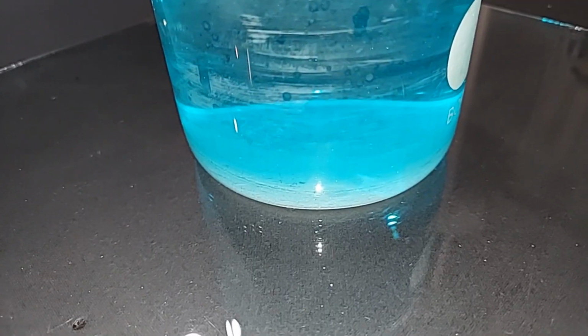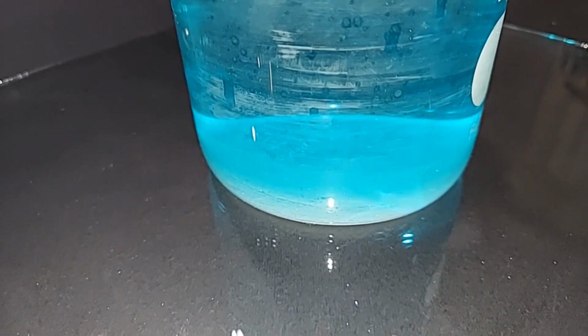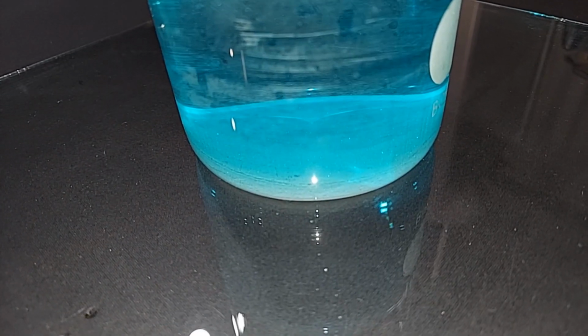Most of the copper 1 chloride has fallen to the bottom. There's still some in there crystallized. You can see the crystals. So I'll wait till it's completely done. But because this is insoluble in water, I'll dump out the top layer and then pour some distilled water in here and dump that out, and maybe do that twice and then save it underwater.